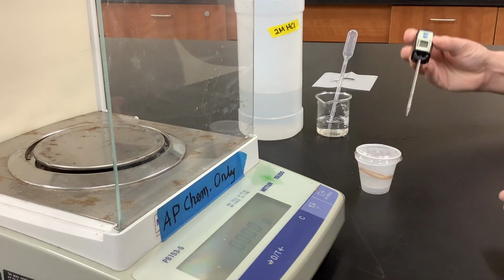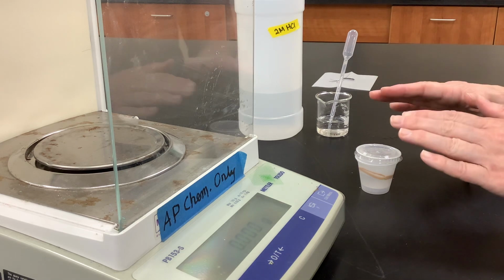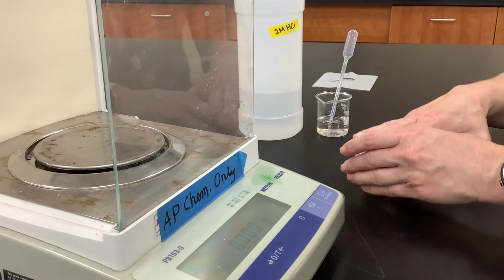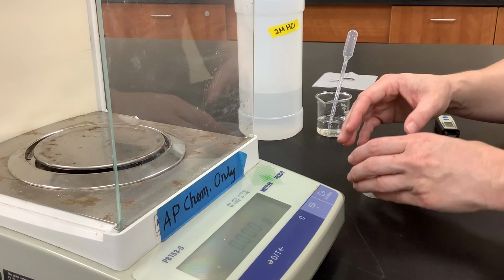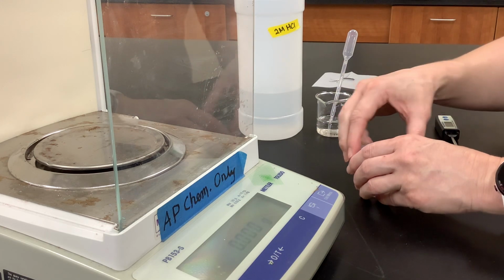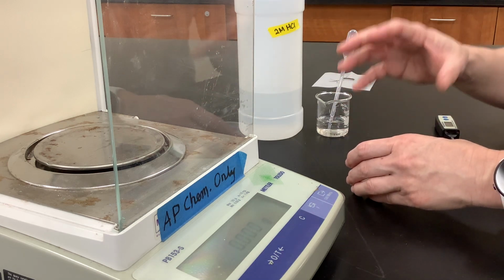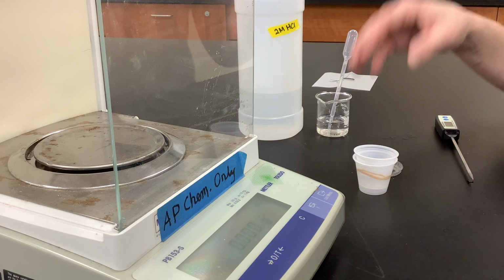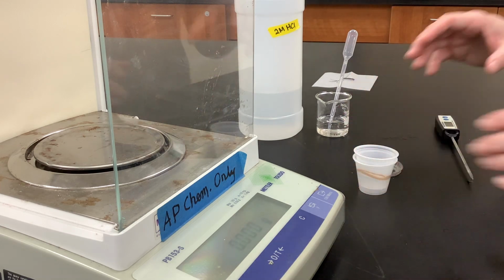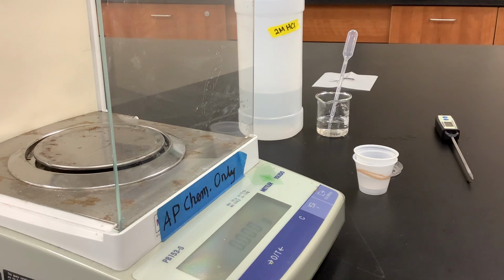Now we're going to repeat this 2 more times. What we need to do is clean up our calorimeter. We're going to dump this into our waste container, and then rinse out our container with deionized water, dry the interior as best we can, and then repeat our steps.